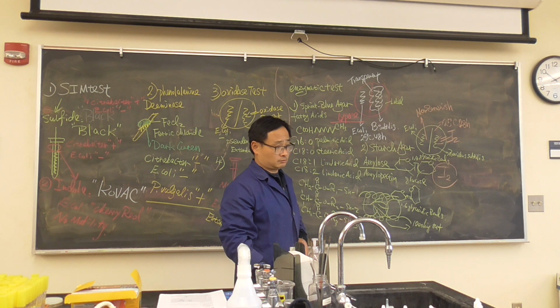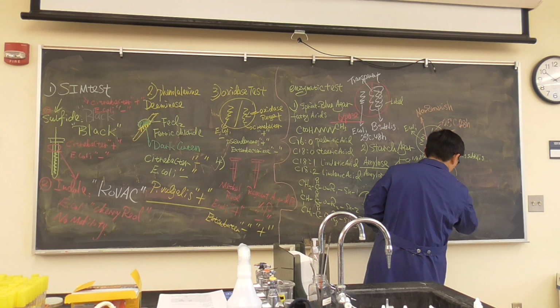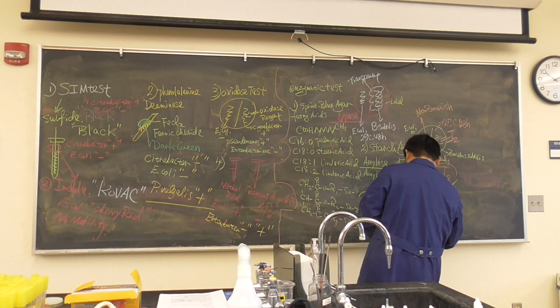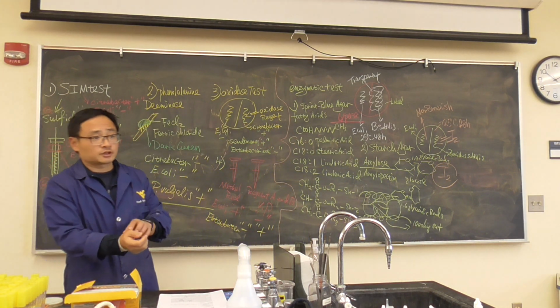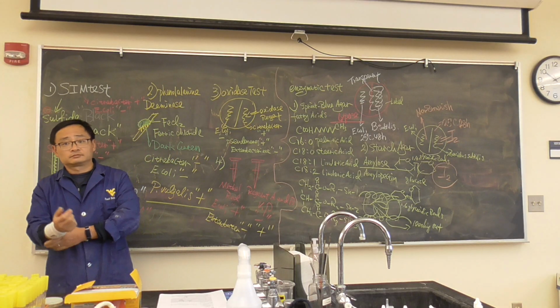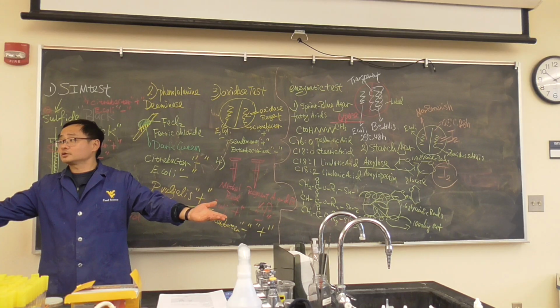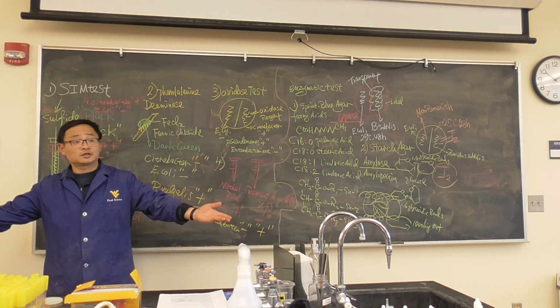So how do we break down starch? Which enzyme? Lipase for lipids. Which enzyme breaks down starch? Is that called amylase?